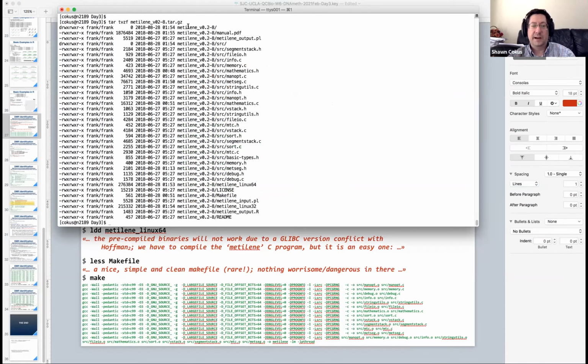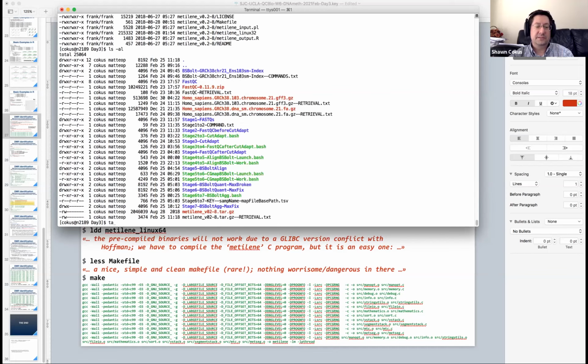So this just shows me what's in there without expanding. And you can see that all the paths are to a subdirectory that it's going to make. This is a hygienic tar. It's not going to dump anything on us at a higher level. You can even have absolute paths in tars, so this is fine. We have nothing to worry about there. So we're just going to expand it, and that is xvf. X for extract, V to show me each line as progress information, and the F means the next command line option is the file.